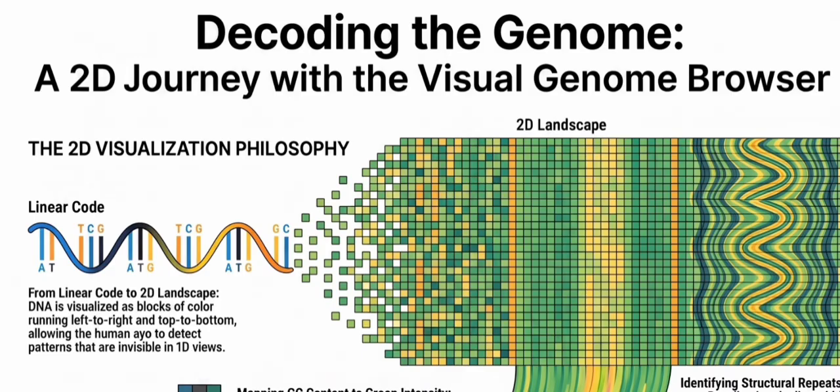This is where the keyboard navigation mechanics introduced in the Visual Genome browser become truly revolutionary. The software deeply integrates structural navigation directly into the physical keyboard. For simple panning, if a researcher needs to move quickly across a region, holding down the Shift key while tapping the arrow keys increases the scrolling speed across the genome by a factor of 10. It's like shifting the map into high gear.